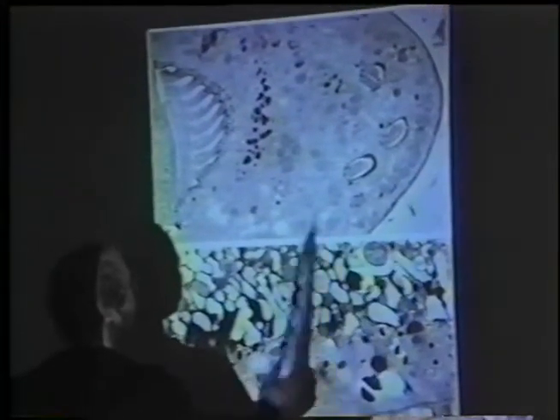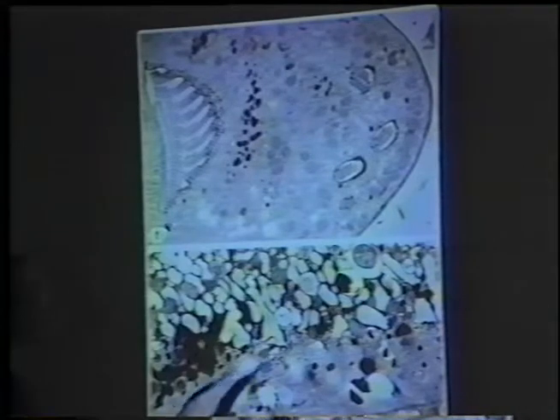Yep, these are a little out of order, but that's all right. This is the marine protozoan Euplotes crassus. It's a very large cell. Let's see, 10 microns here would be about from here to here. The cell is a couple of hundred microns wide, a few hundred long, and about 50 microns thick. This is frozen in the jet freezer and freeze substituted. I'll go into freeze substitution a little bit toward the end of the talk.